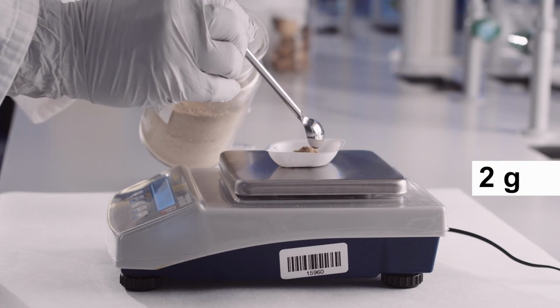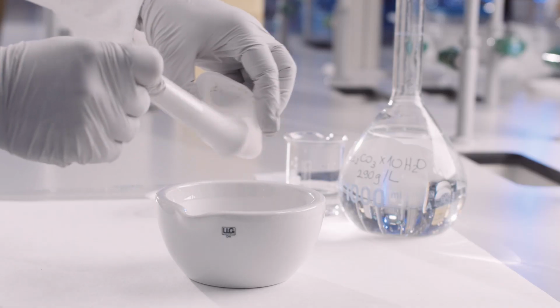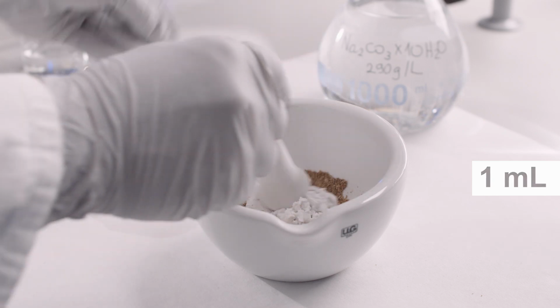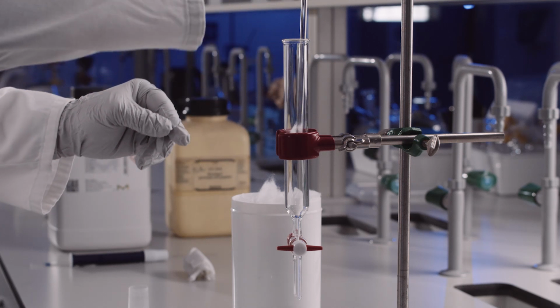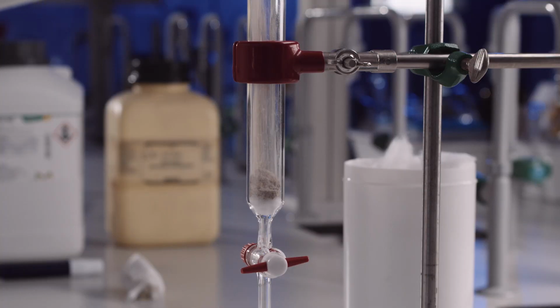To perform column chromatography, weigh and mix in a mortar 2 grams of powdered poppy capsules, 1 milliliter of saturated sodium carbonate solution, and 3 grams of deactivated silica gel. Put a piece of cotton wool on the bottom of the glass column to prevent the stationary phase particles from leaking out of the column. Then add to the column the previously prepared mixture of ground poppy heads, sodium carbonate and silica gel.